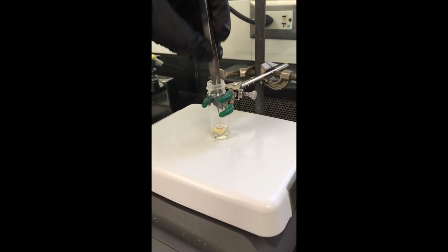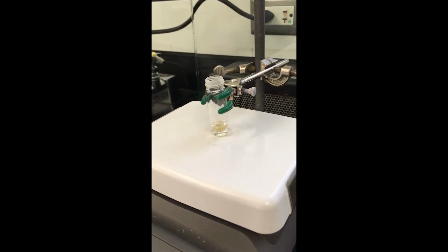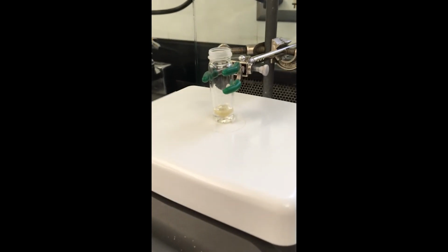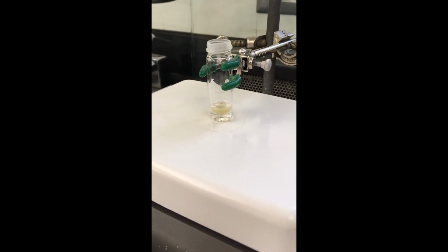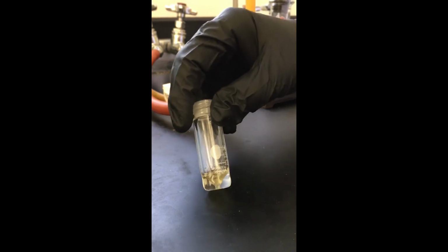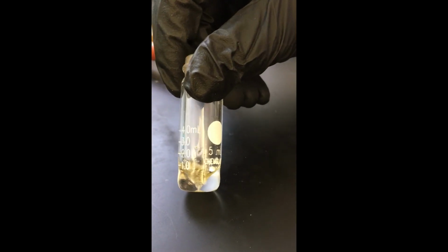And then I'm just going to remove that spin vane. And then we're going to let that vial sit for 20 to 30 minutes and let crystals form. It's going to take a little bit of time for the crystals to precipitate, but they will form. All right, so as you can see here, now that I've added the toluene and let this sit, we actually do have some solid crystals in here.